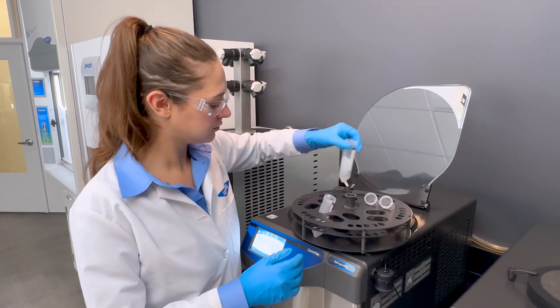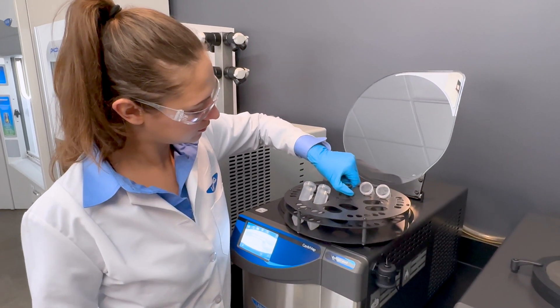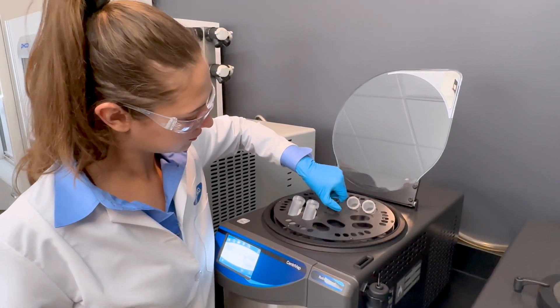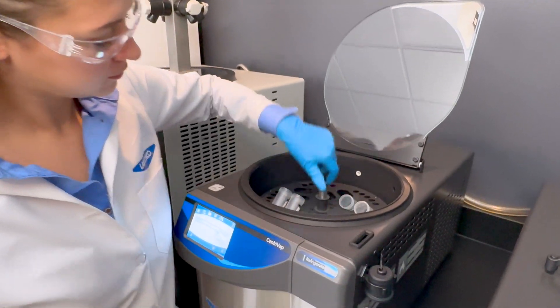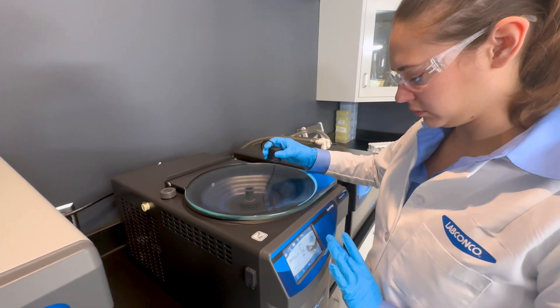Out-of-balance detection alerts users to unbalanced rotors that may damage the instrument, keeping your Centrivap safe from costly mistakes. The Centrivap strobe light allows for easy sample monitoring without interrupting your run.